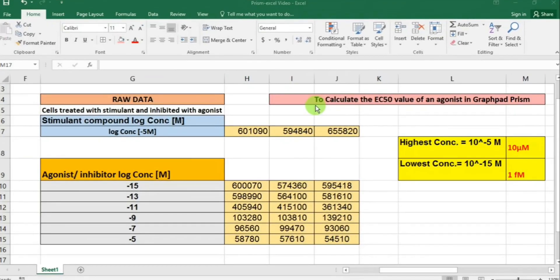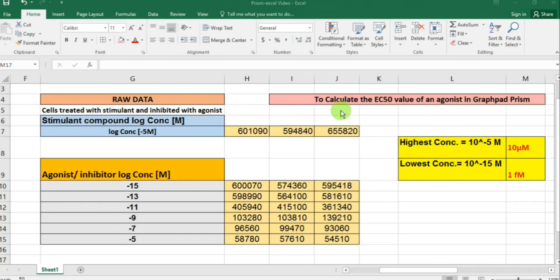In this short tutorial video I'm going to be showing you how to calculate the EC50 value, or the potency of an agonist, in GraphPad Prism. Before we jump into the Prism file, let me introduce you to my raw data first.